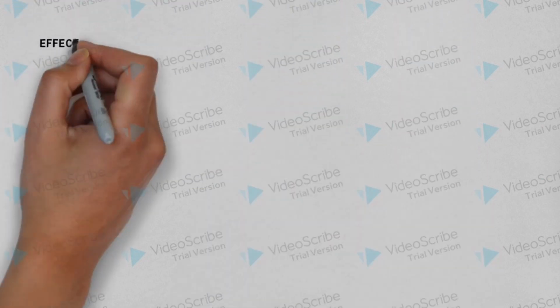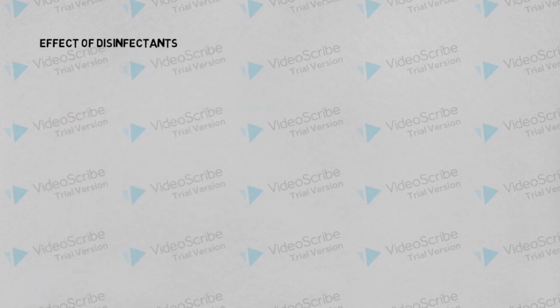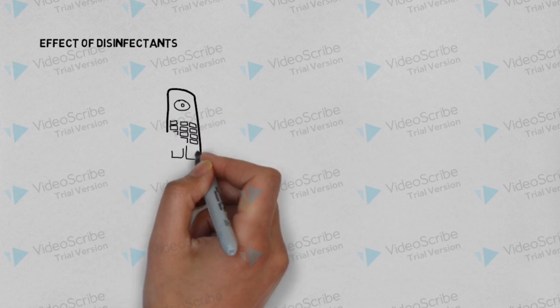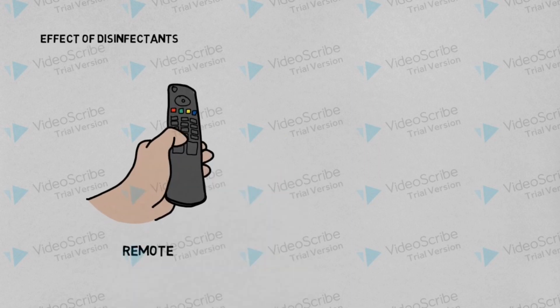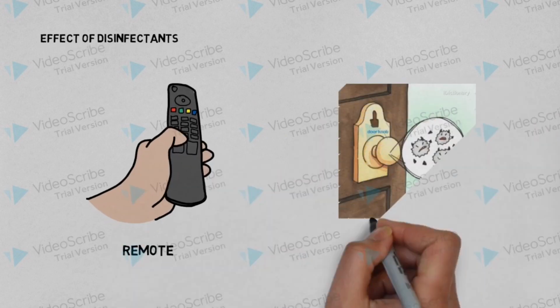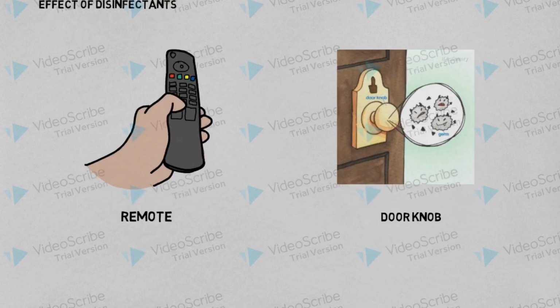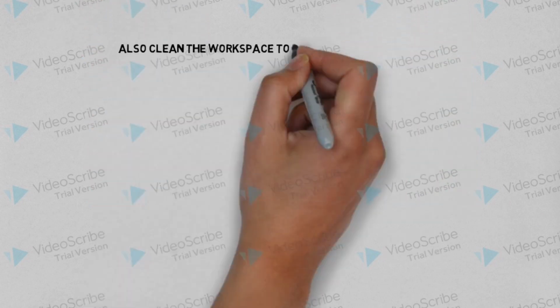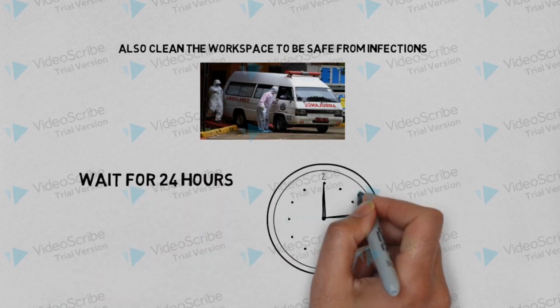Lastly, we check the effect of disinfectants on these bacteria, for which we need to collect samples from the most accessible places in our homes, for example, remote, doorknobs, etc. After collecting the samples, we streak them on the potato and seal them. Then we spray the disinfectants on our object, again take the samples and streak them on the potato. Then we clean our working area as we don't want to encounter any infection, and wait for the next 24 hours for the results to show up.